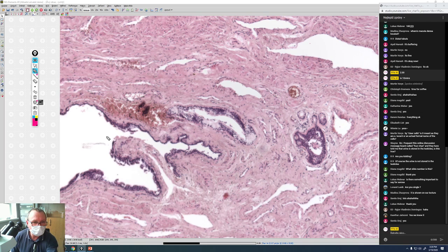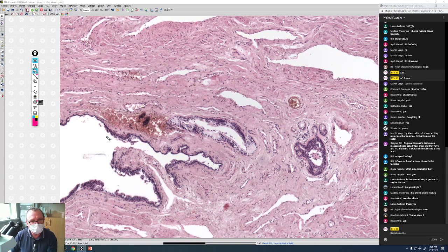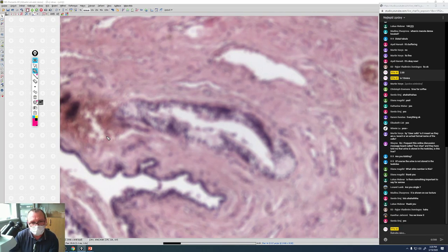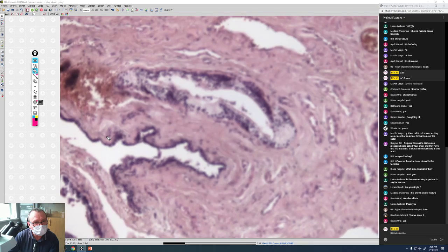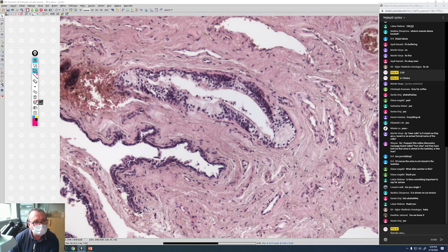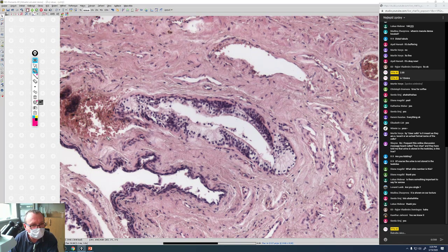Now, I can see that there is a columnar epithelium, like here. It is a piece with columnar epithelium and Littre's. I guess that it is a Littre's gland and it's the beginning of its duct. But these aren't intraepithelial. It's like Morgan's lacuna, but as it is not in the main lumen of the urethra, it must be a gland. Okay. Yeah?